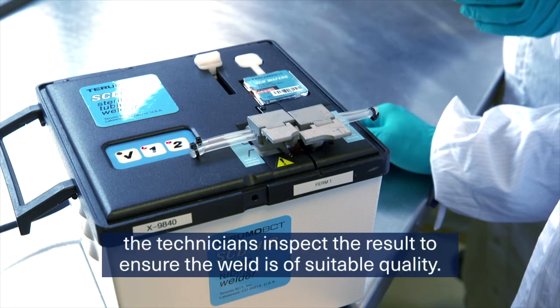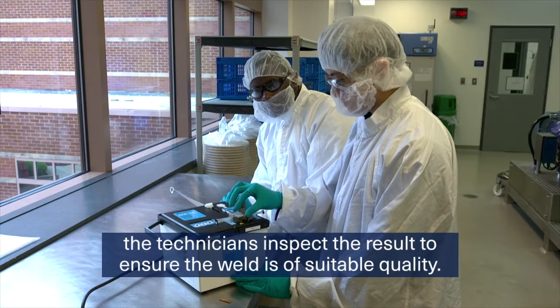At the end of the process, the technicians inspect the result to ensure the weld is of suitable quality.